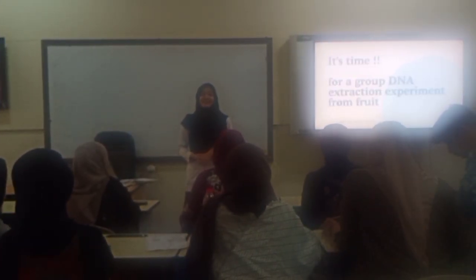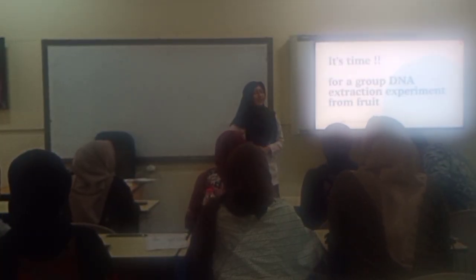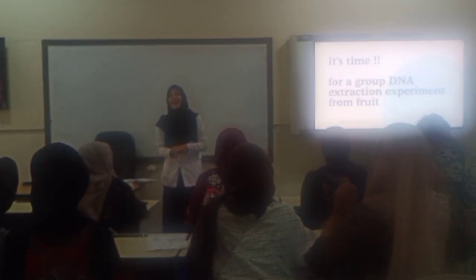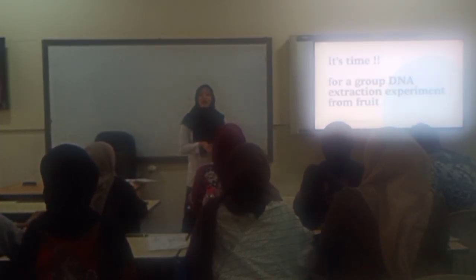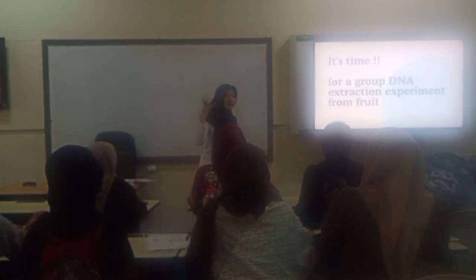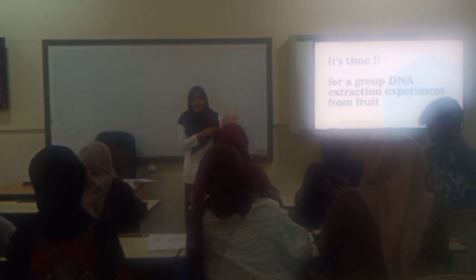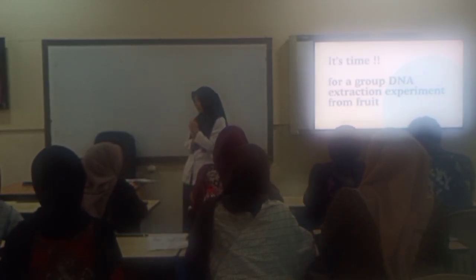Experiment? Yes. How exciting, the DNA extraction or something? Exciting? Okay. Exciting. How is the practical? Is the DNA visible or not? Visible. Completely visible. You can see the DNA. Yes, Miss. Yes, see, yes. Okay, it looks white here.